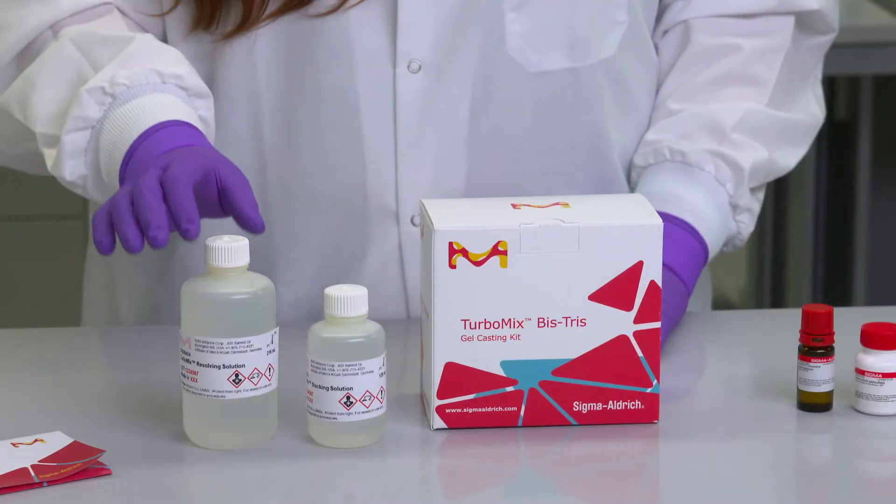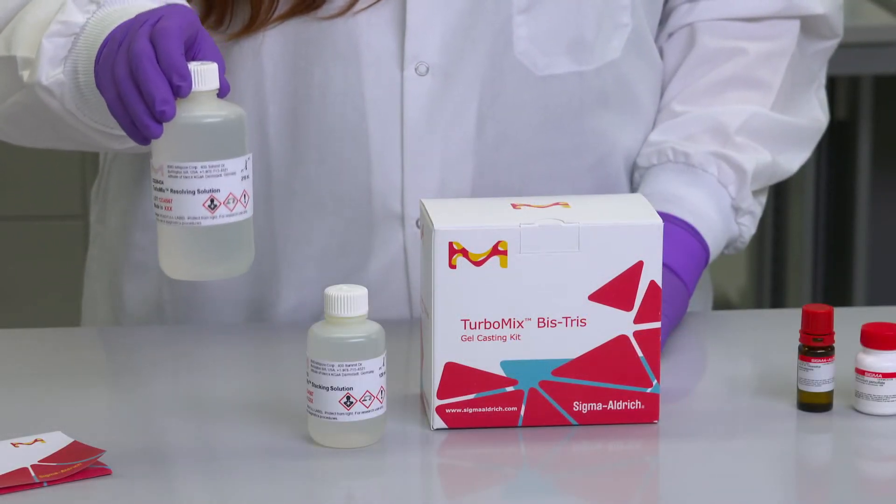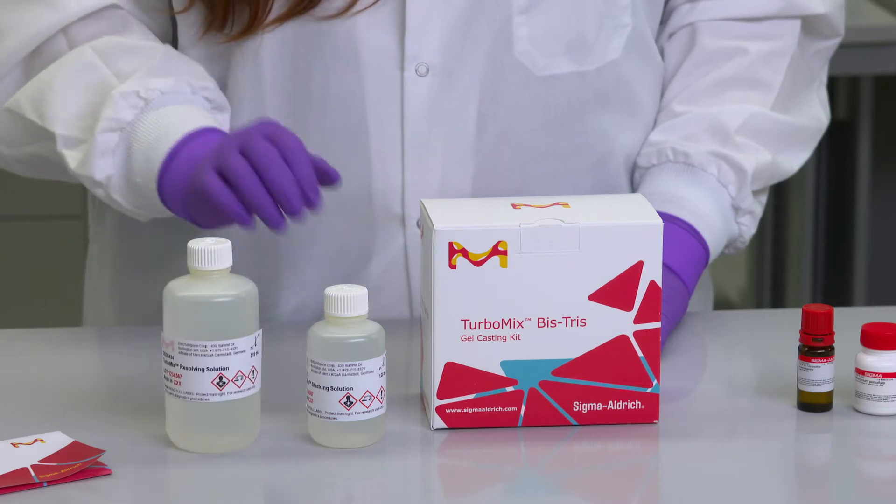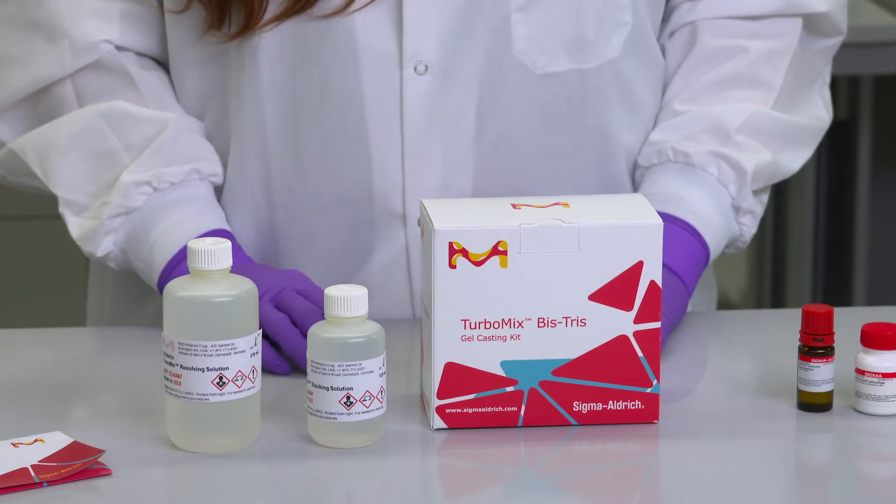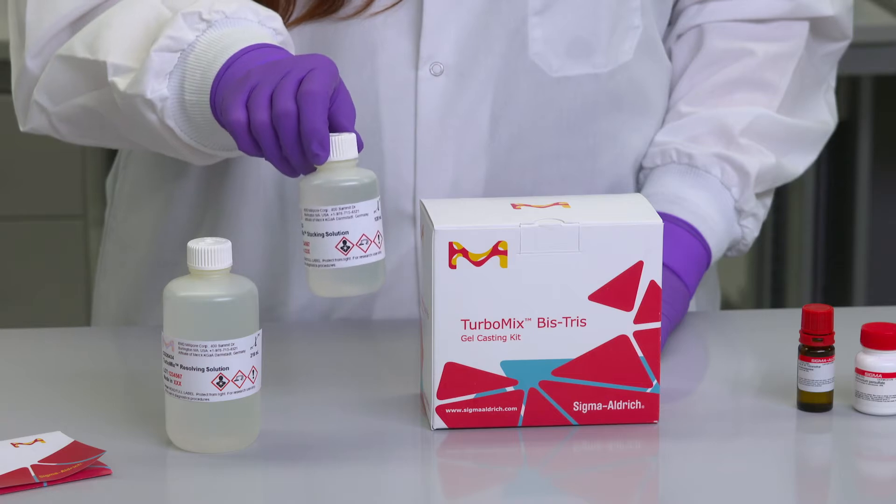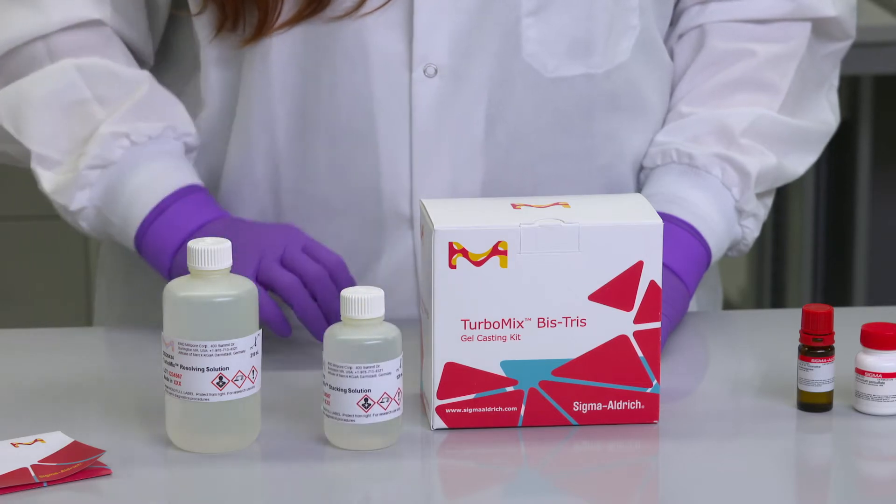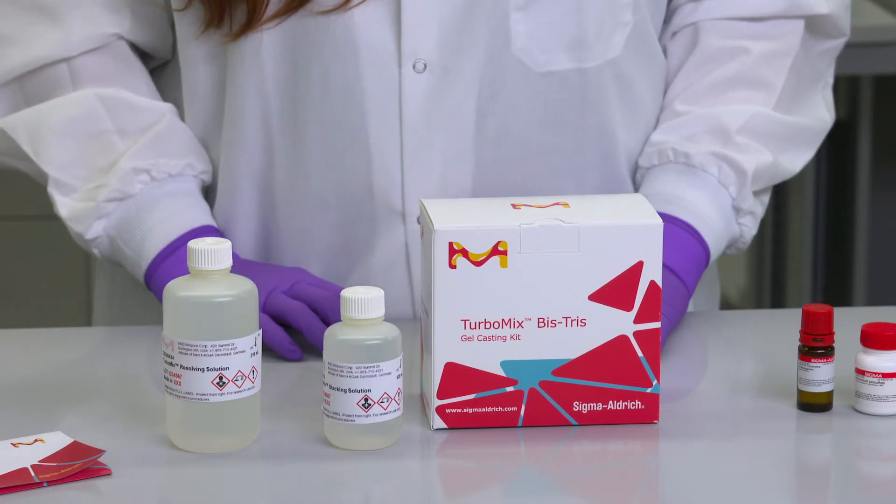The TurboMix Kit includes a resolving solution which is used to form the bottom resolving portion of your gel and a stacking solution to form the top stacking portion of your gel. The TurboMix resolving solution is specially formulated to allow users to dilute it to their desired acrylamide percentage using only deionized water.